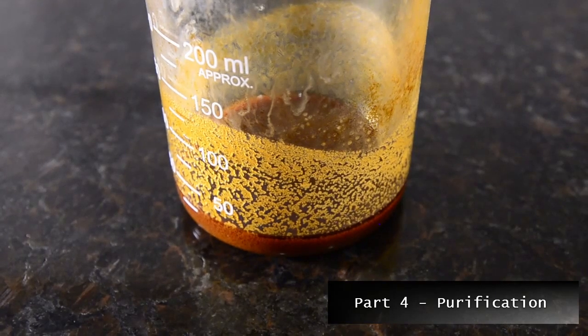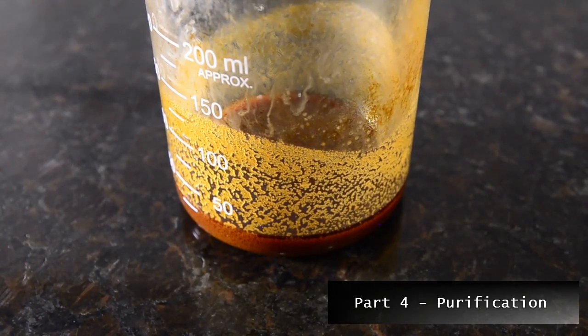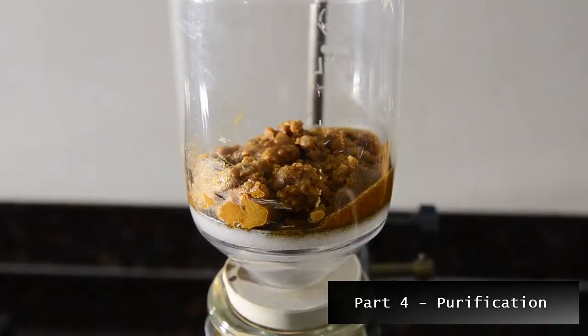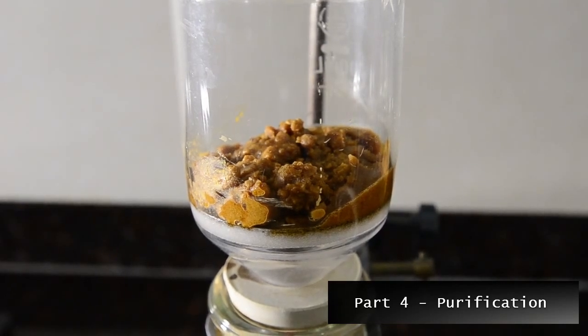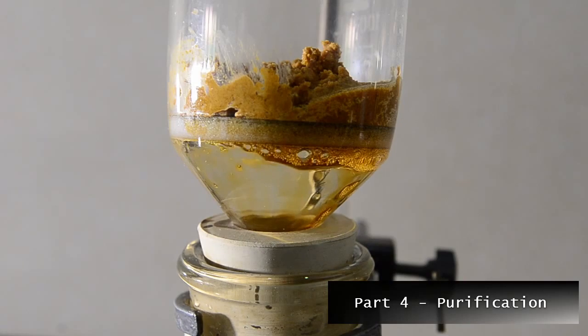Chill the mixture down to form a thick slurry of crystals. Place these into a filter funnel and then use vacuum to get as much of the orange liquid off as possible.